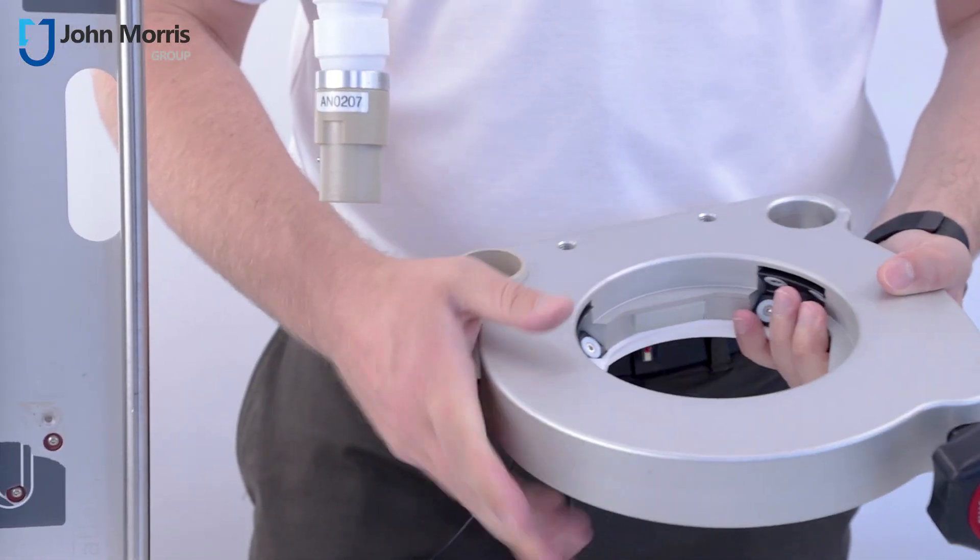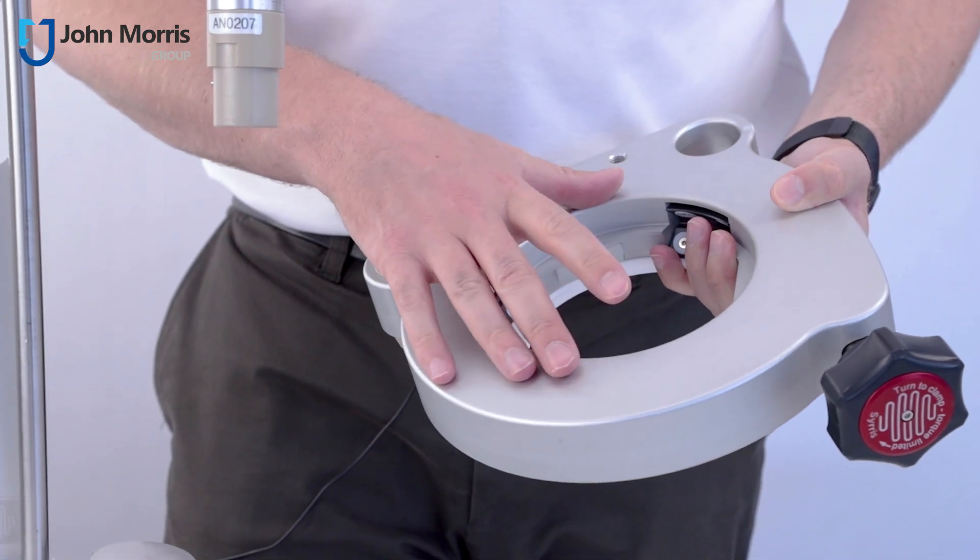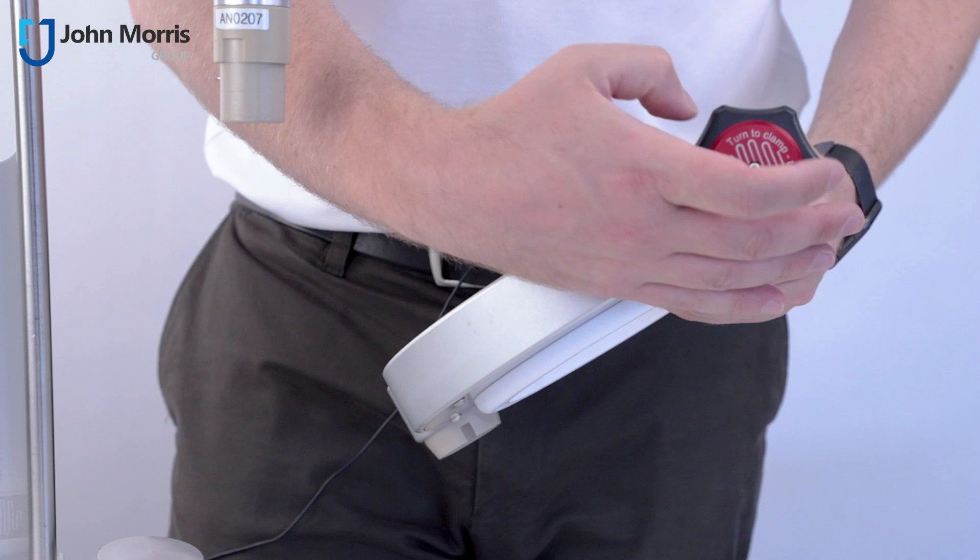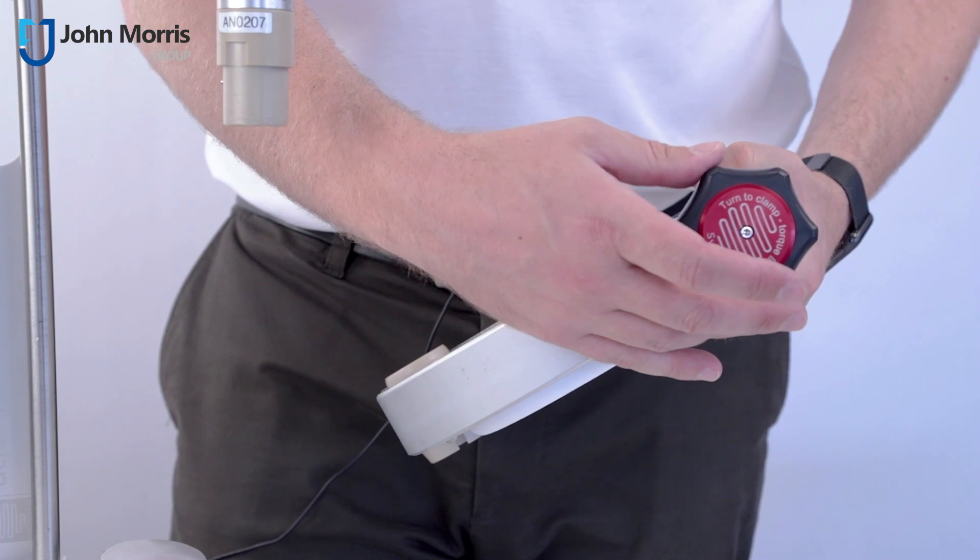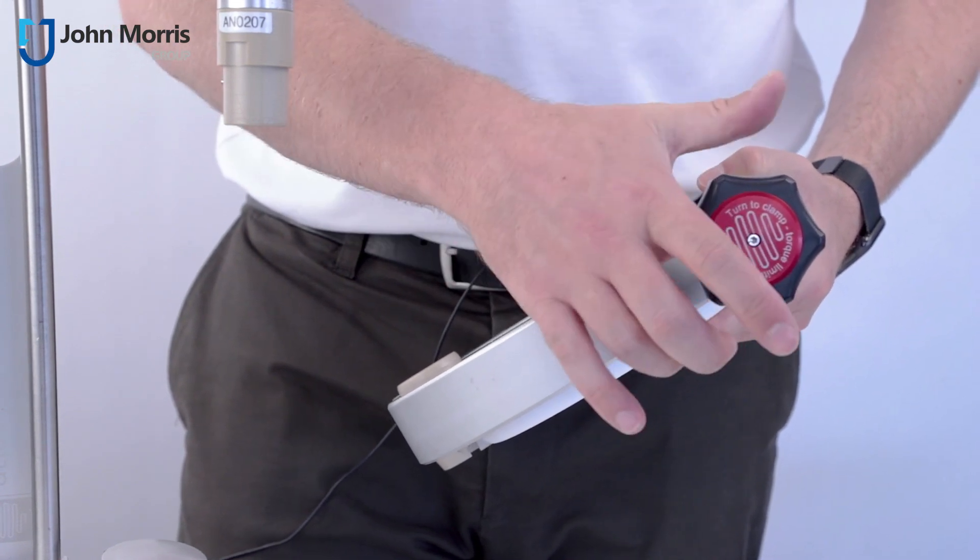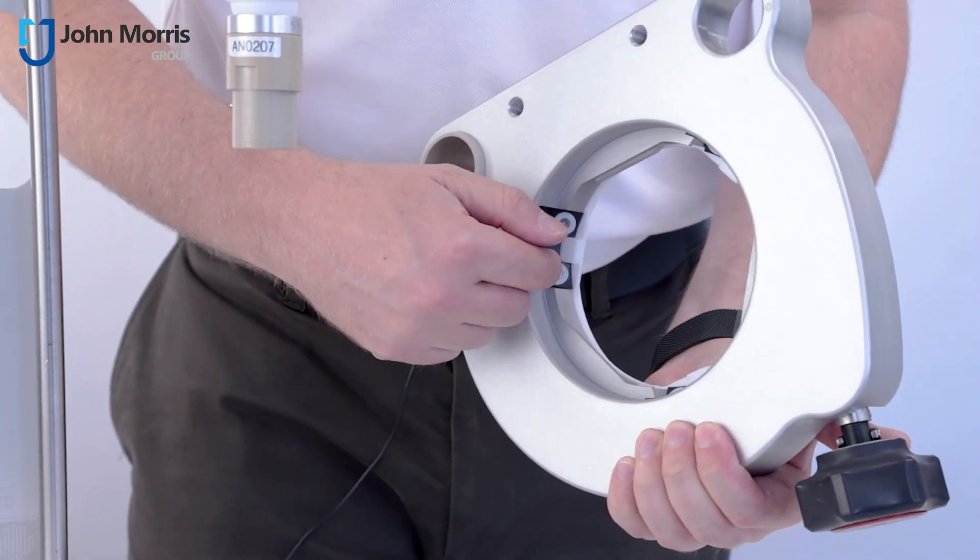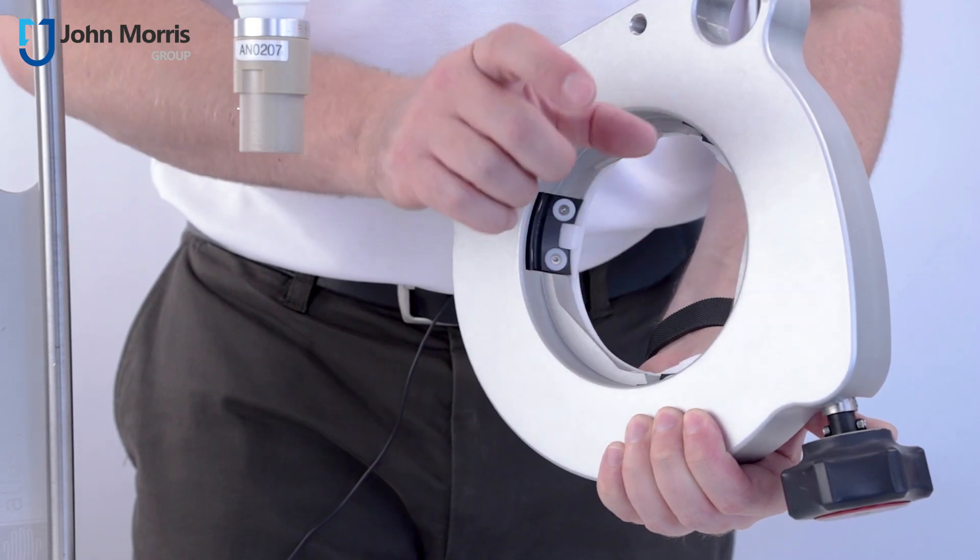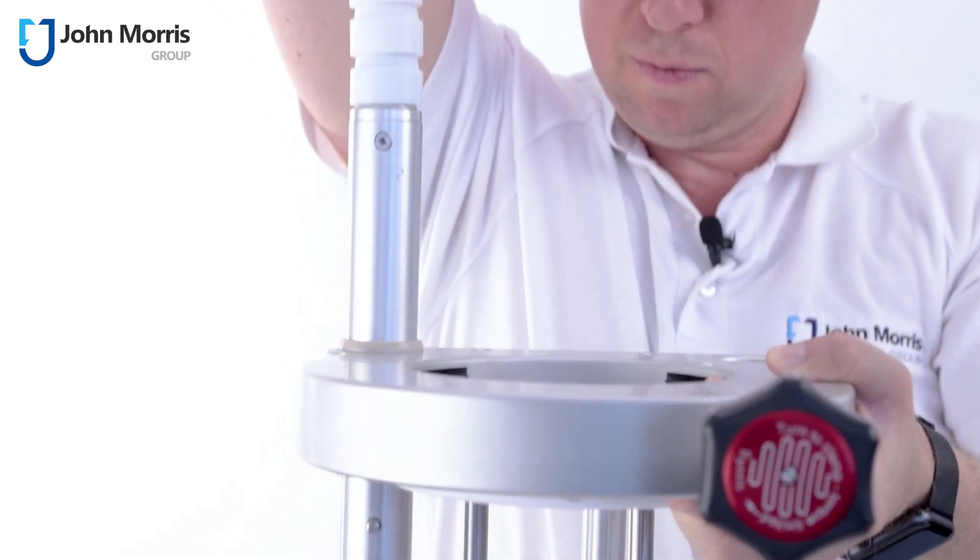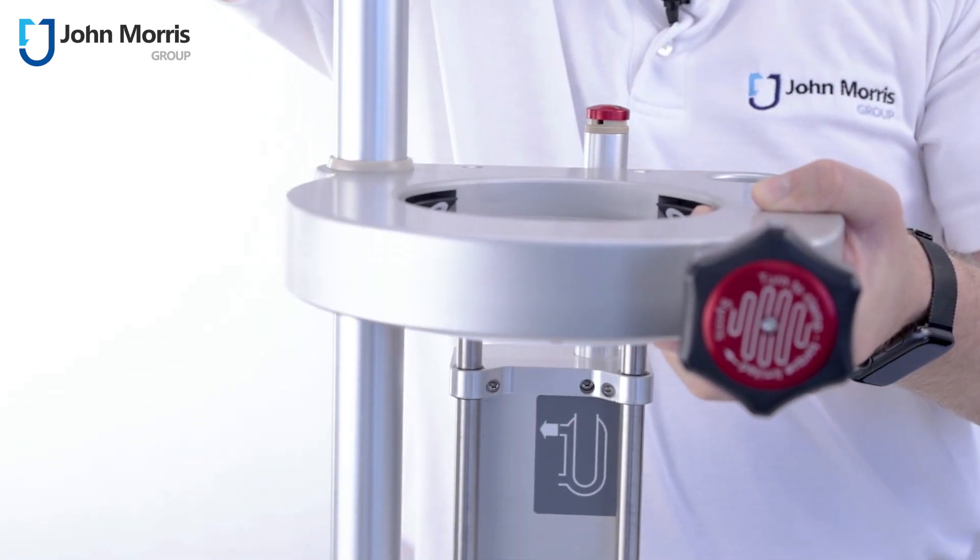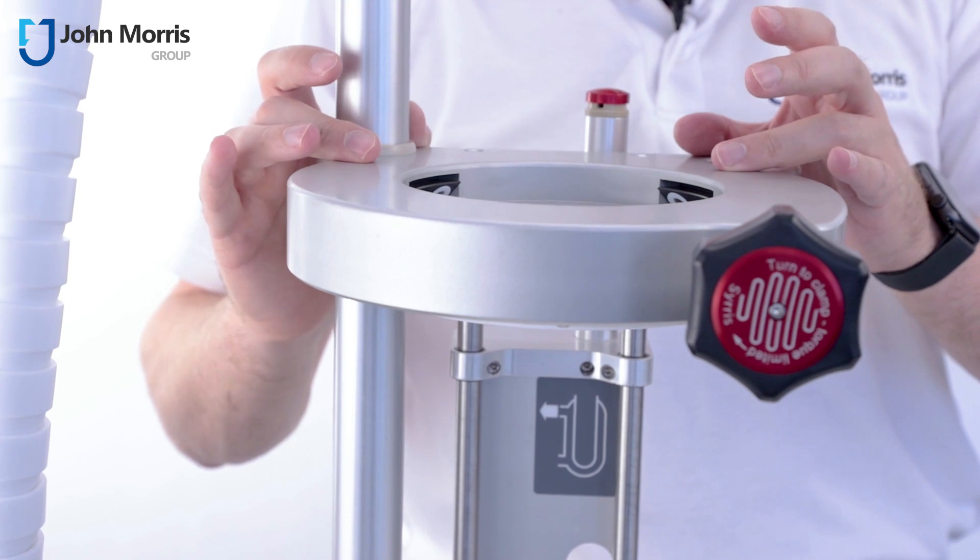What we have here is a means to actually hold our glass vessel in place and there's a number of really important points about this particular component. Firstly you use this knob here to tighten the lid in place, but it's a ratchet style so once it's at desired tension you can keep turning but you will not break the glass, and the way that it holds it in place is these three teeth here move closer in to keep the lid on the vessel. So this single clamp can hold just about all of the different sized vessels.